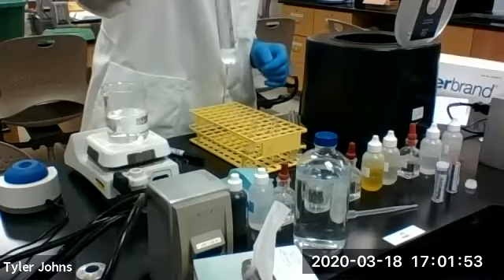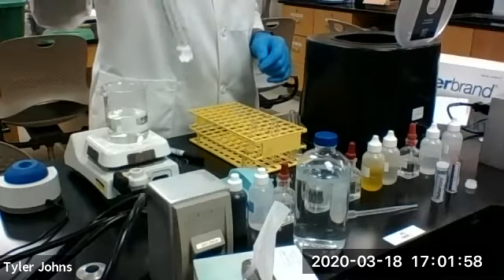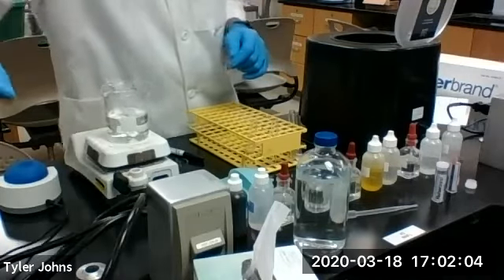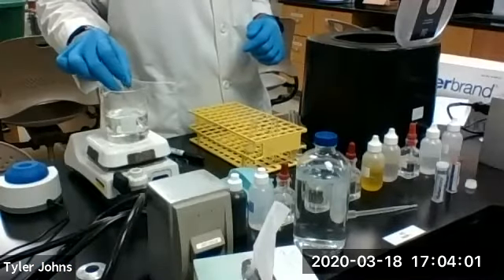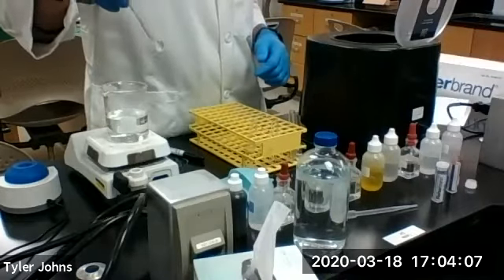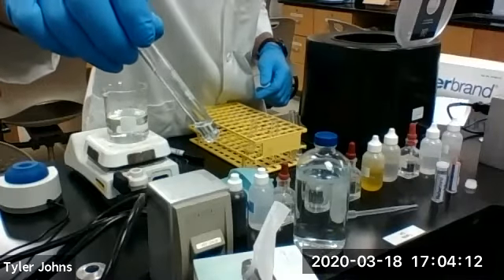And then we are going to warm the mixture gently to dissolve the carbonates. Okay, after the addition of 6 molar acetic acid and the warming, you can now see that the carbonates have dissolved in solution.